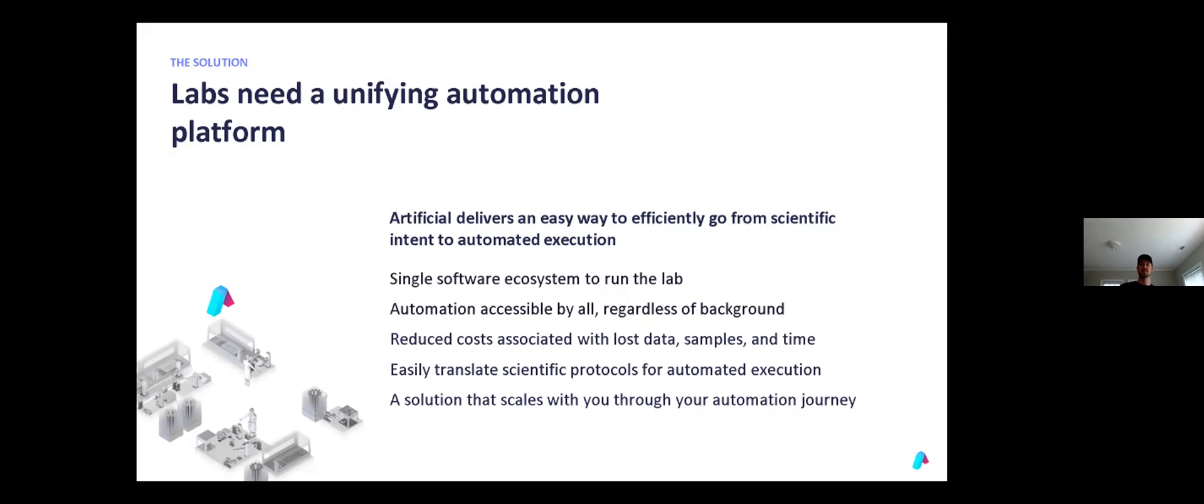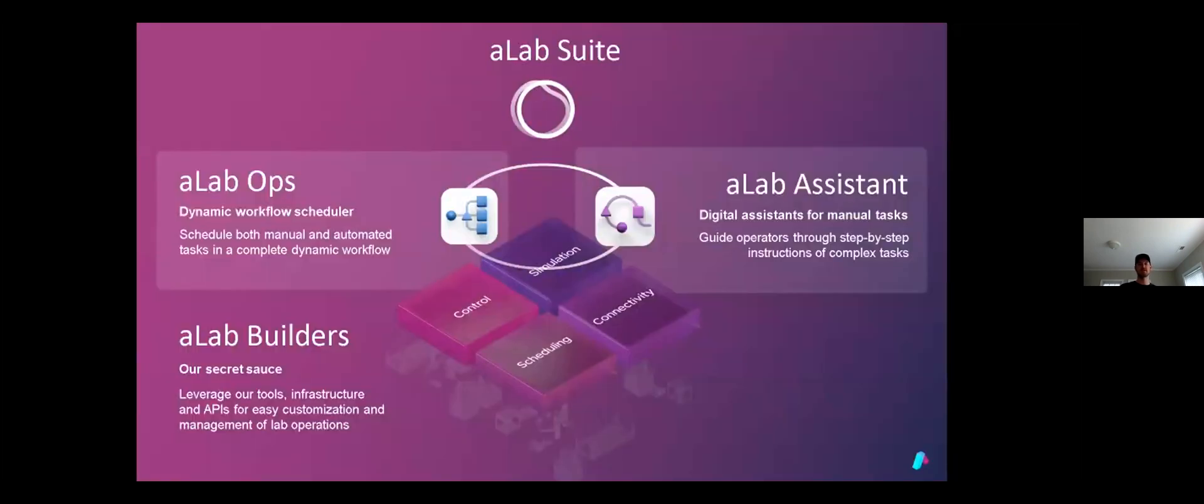To go a bit deeper into how we accomplish this, I'll walk through the steps from a request to process results. In A-Lab Ops, we aggregate all of the process requests, either through connectivity to a LIMS or by having users directly enter a request in A-Lab, and display them such that they can be filtered by process, sample type, or other metadata.